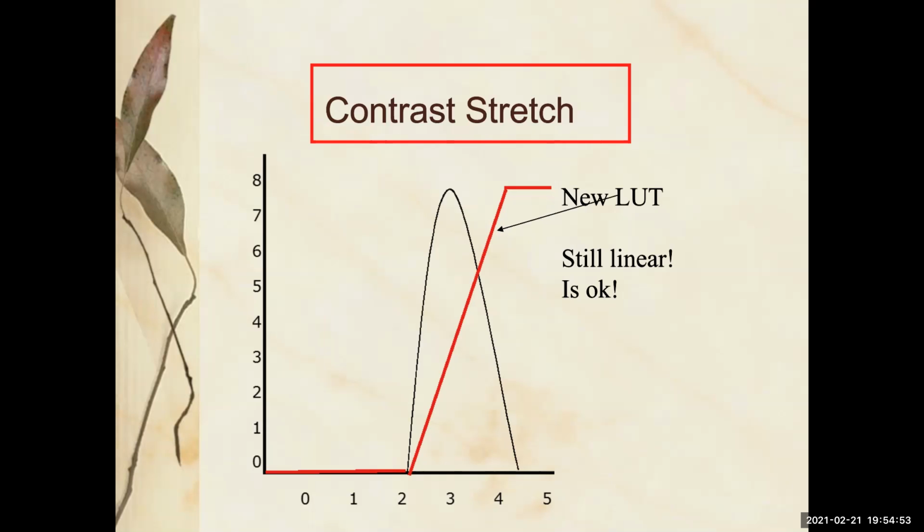But one of the ways that we make images better is we take an image of something totally black where there should be no signal and figure out what the noise is and then subtract that, because noise is usually dark and it's random. So anyway, altering the offset is a common thing. And you figure it out on your scope and your system. But like I said, you leave some room. You don't stretch out your histogram till it's touching the edges. You're leaving a little bit of space in case there are some surprises and you want to be able to capture them as you're imaging.